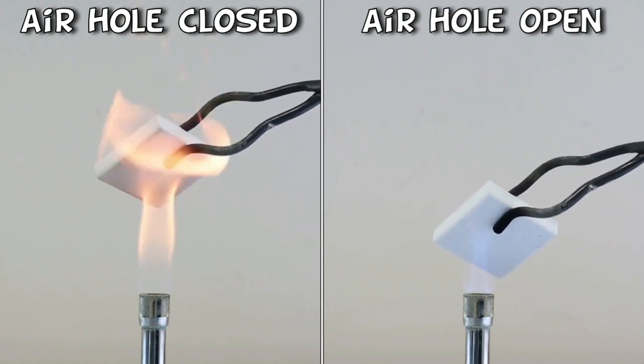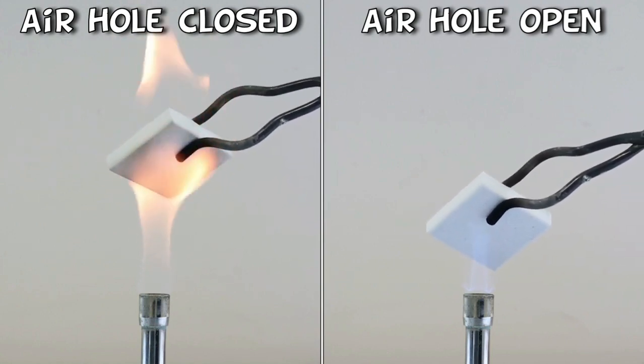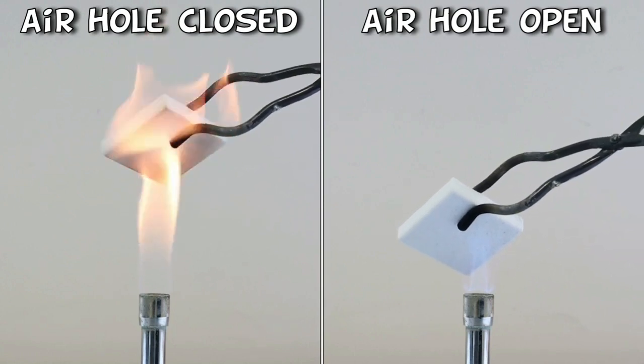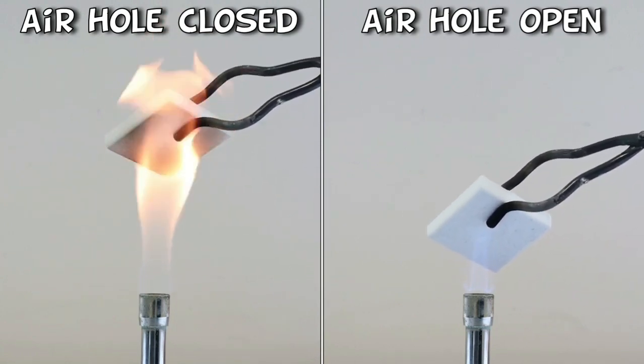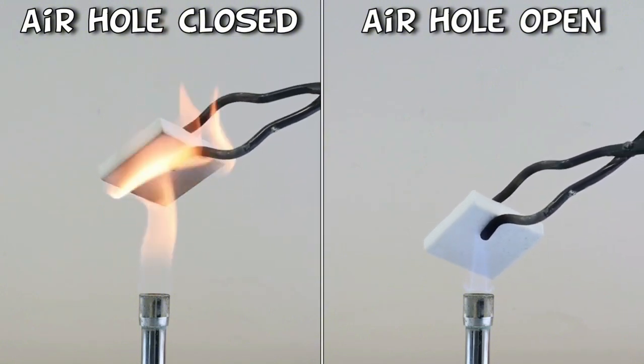If you tried to heat a beaker of water on a tripod above a Bunsen burner on a yellow flame, you'd find that the beaker quickly turns black with soot as well. So hopefully this has given you a better understanding of how Bunsen burners work.